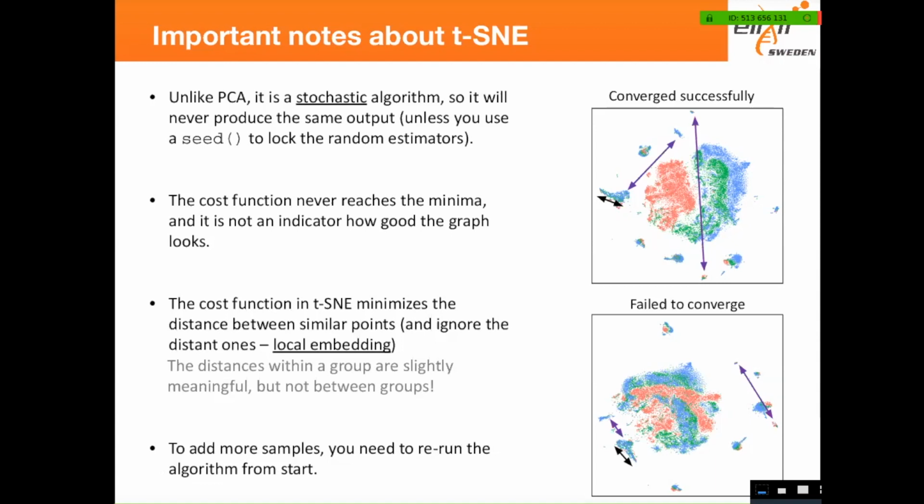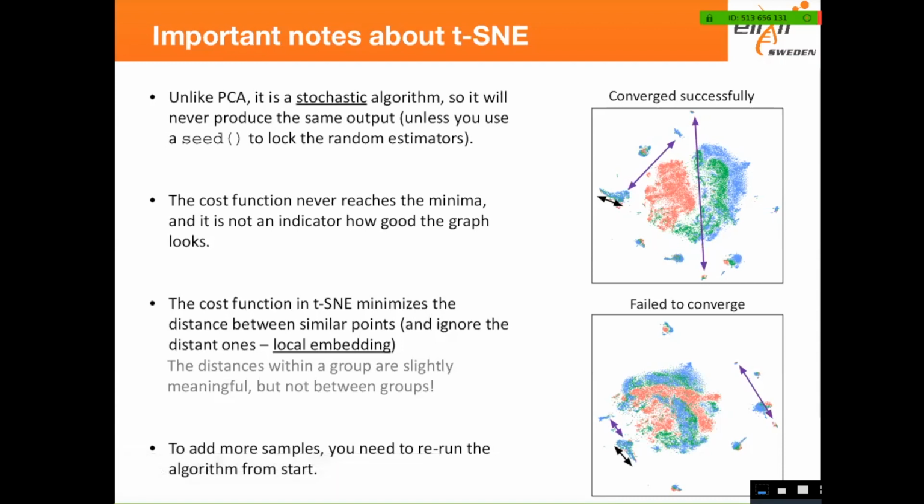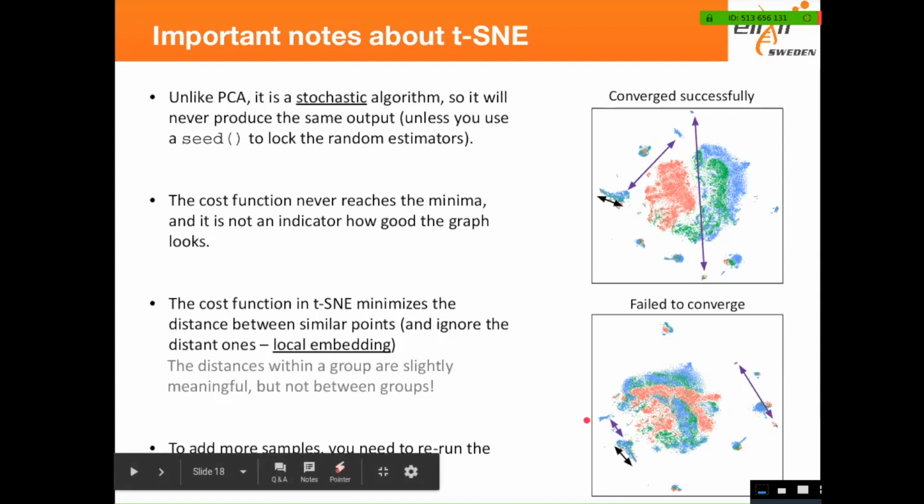That was a quite common strategy, but I would highly recommend going for a graph-based approach, because with tSNE you lose a lot of the resolution. You compact your data into this two-dimensional space, and you lose some of the relationship between clusters and cells, so it could be biased. If you want a fast approach, the density-based clustering that you will probably hear about today is quite fast, so you will still be okay if the clusters are quite well separated.